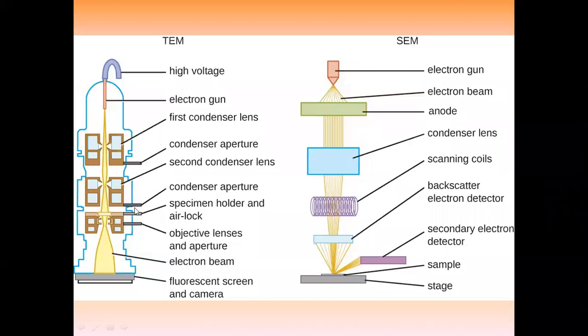So you take out the stage, place the sample, and put the stage back. Then the stage is moved throughout so that the electrons fall on the sample throughout, and the possibility of all directions of the electrons will be captured or emitted throughout the sample.